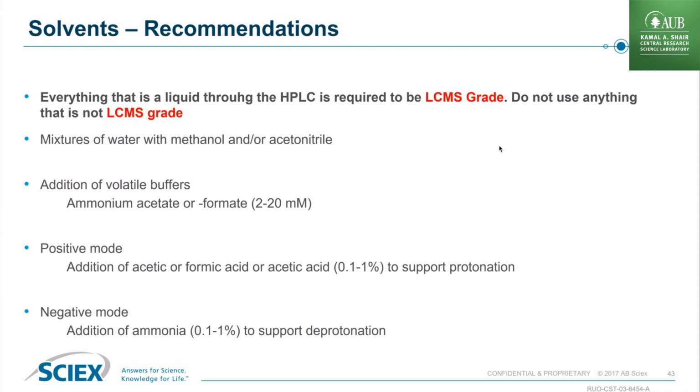So for that reason, and also for the cleanliness of the instrument itself, so the instrument does not get dirty, as I mentioned in the interface region, we do have to clean every now and then. Everything should be LCMS grade. So please do not use anything that is less than LCMS grade on the instrument.